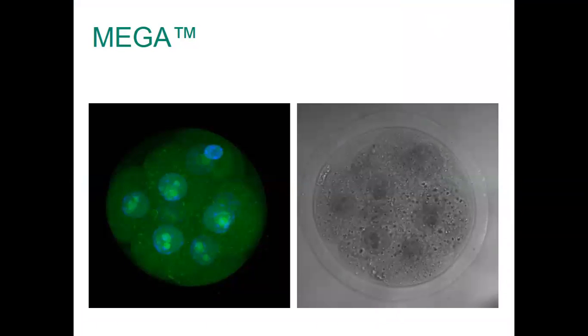Here are two pictures about MEGA. On the right side is a picture of a mouse embryo at 48 hours with a normal morphology check. But for MEGA, under the fluorescent scope, you will see green fluorescence, and the blue one shows the nuclei. That's what you will see from the MEGA assay.